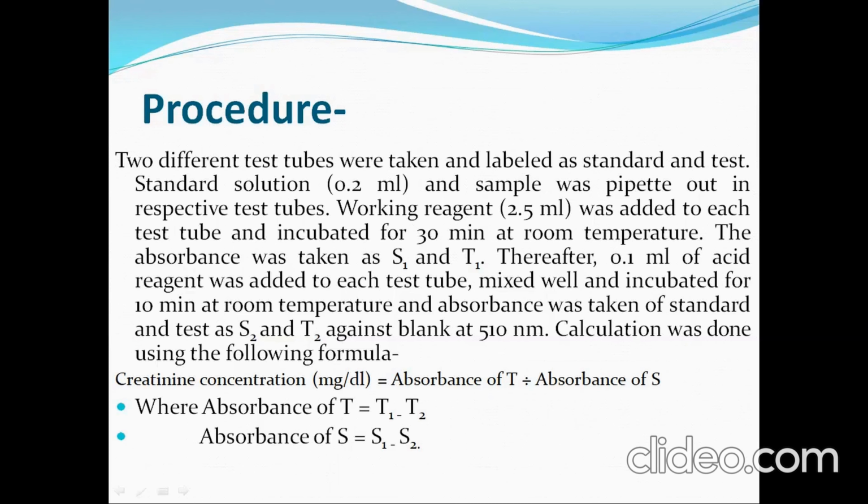Working reagent, that is 2.5 ml, was added to each test tube and incubated for 30 minutes at room temperature. The absorbance was taken, that is S1 and T1. Thereafter 0.1 ml of acid reagent was added to each test tube.